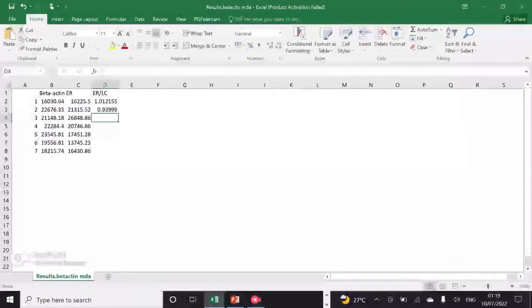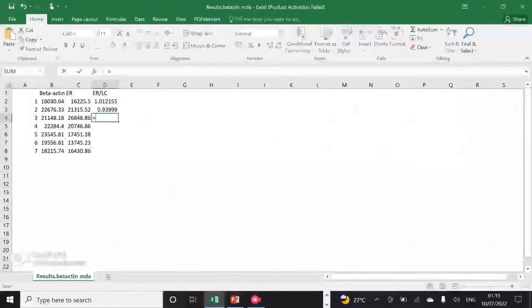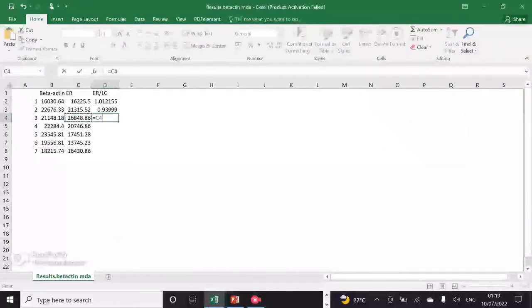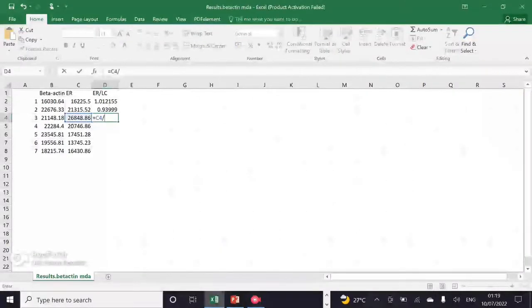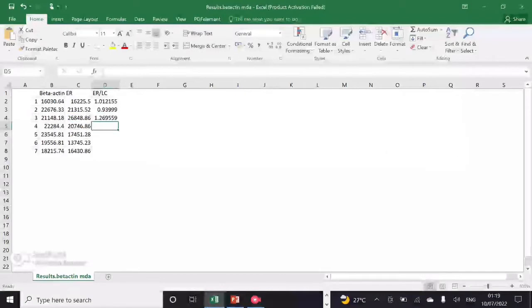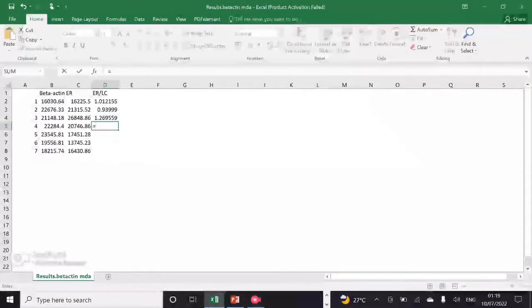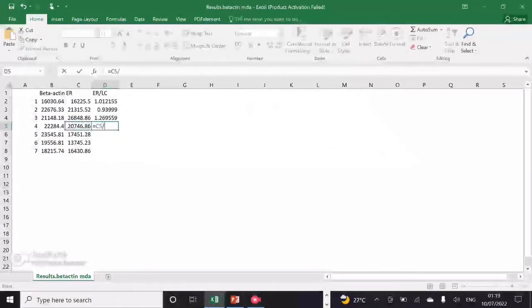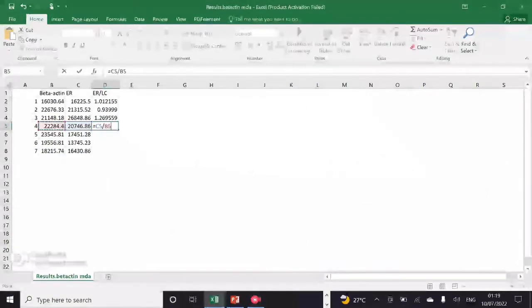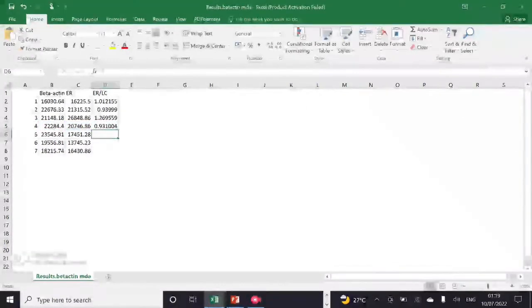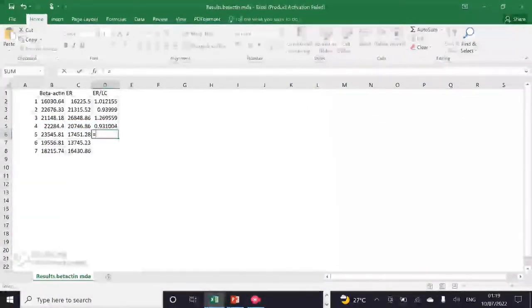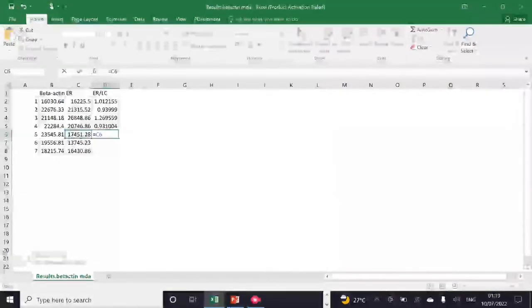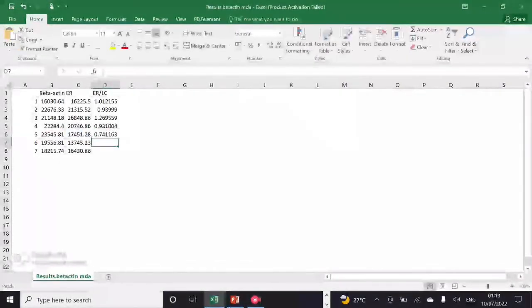The goal is to determine the highest protein expression among your different sample groups. So let's get started. Here you can see in my Excel file I already have the beta-actin values and ER values that have been obtained from ImageJ. Now I have to normalize my protein of interest values with my loading control values, which is beta-actin.